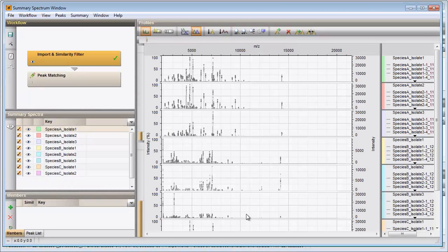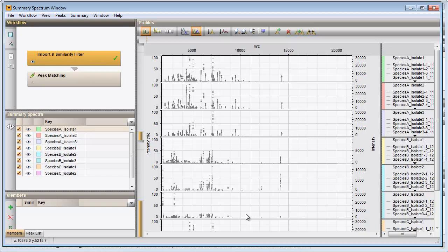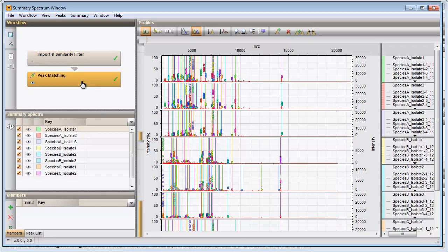The Summary Spectrum window opens with raw spectra organized into eight summary spectra. I press Peak matching to calculate the summary spectra and to identify the summary peaks. The summary spectra appear as thick red lines and the summary peaks appear as thin vertical lines.